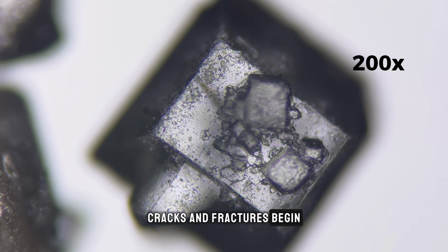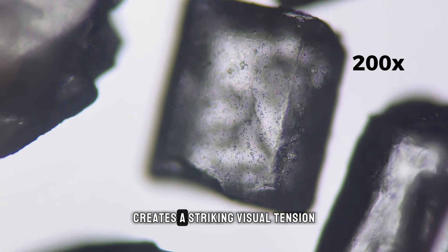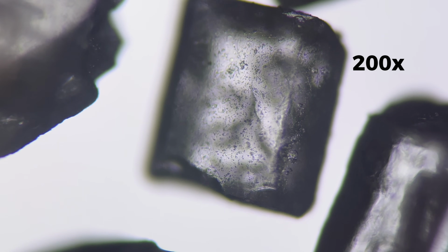Cracks and fractures begin to show along the edges, suggesting points where the crystal could easily break. Small fragments sit near larger crystals, likely broken off during handling or preparation. The contrast between perfectly straight edges and damaged surfaces creates a striking visual tension.